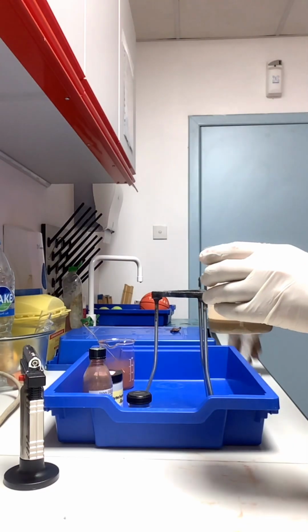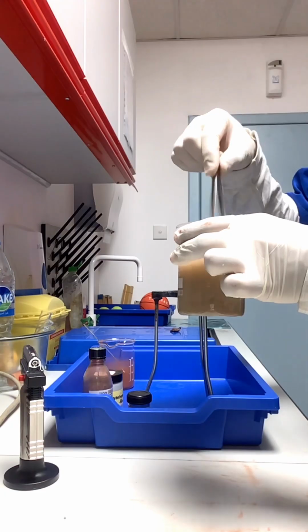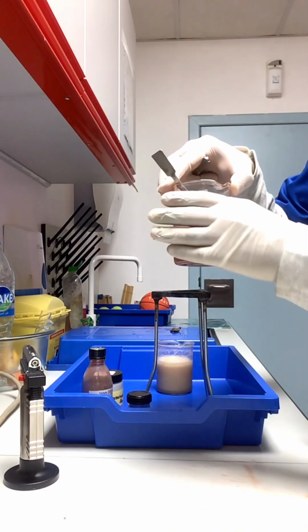You can either dissolve it or it could be sinking at the bottom. The sand could be sinking at the bottom, that's completely fine. And a beaker to mix all your ingredients or your compositions.